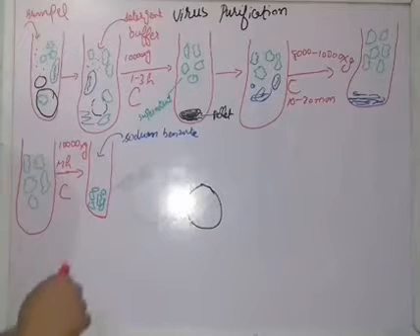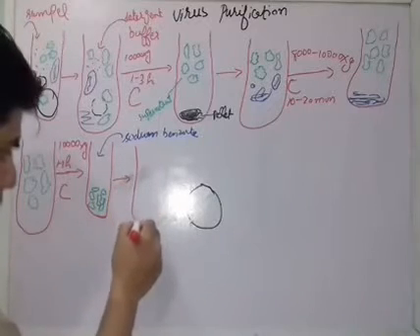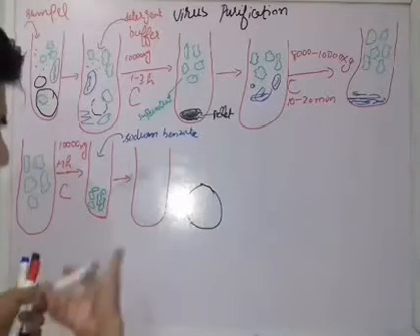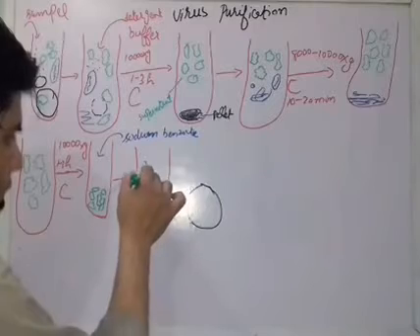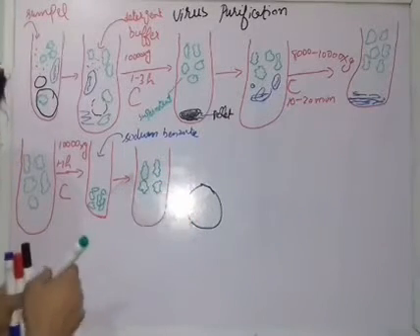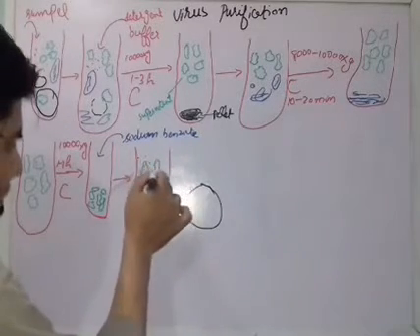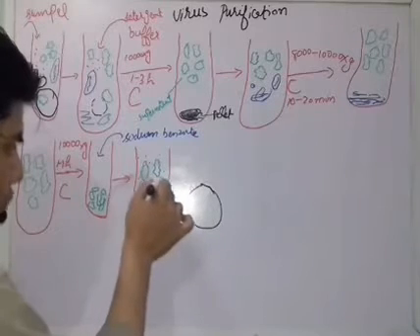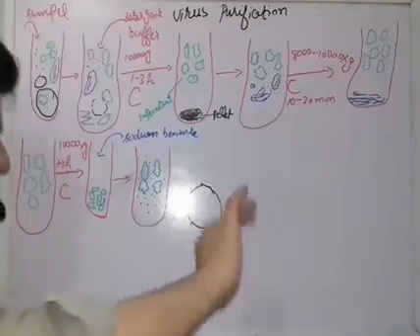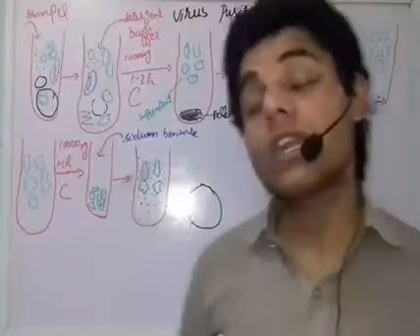So what do we get? We not only get the viruses, the sodium benzoate is also present. Let's suppose these black dots represent the sodium benzoate, which washed out the precipitate, and means they purified the viruses now. But these viruses still contain the sodium benzoate.